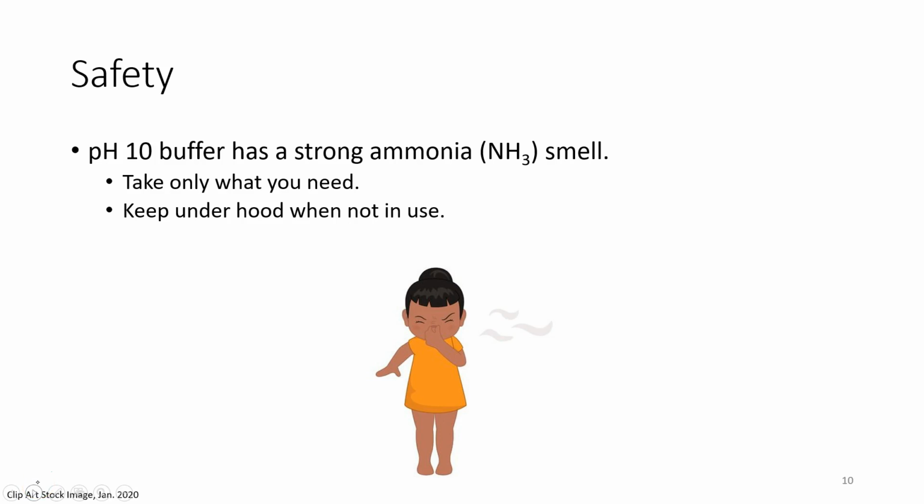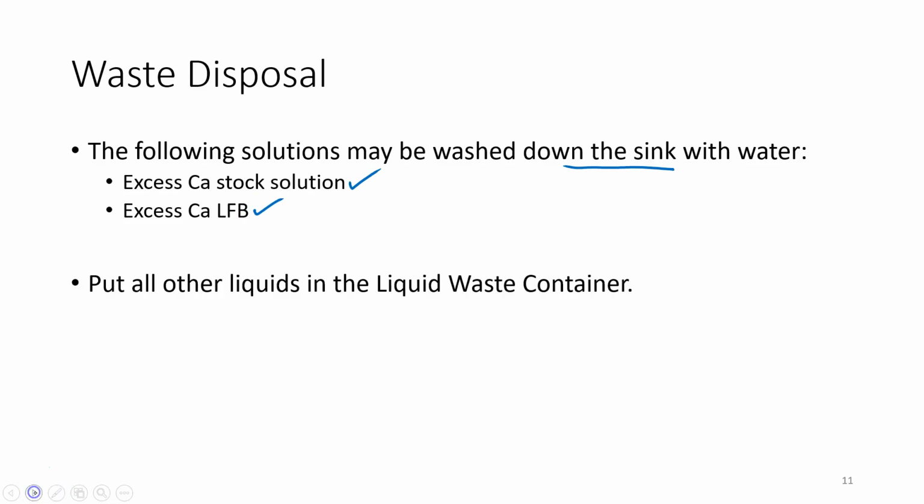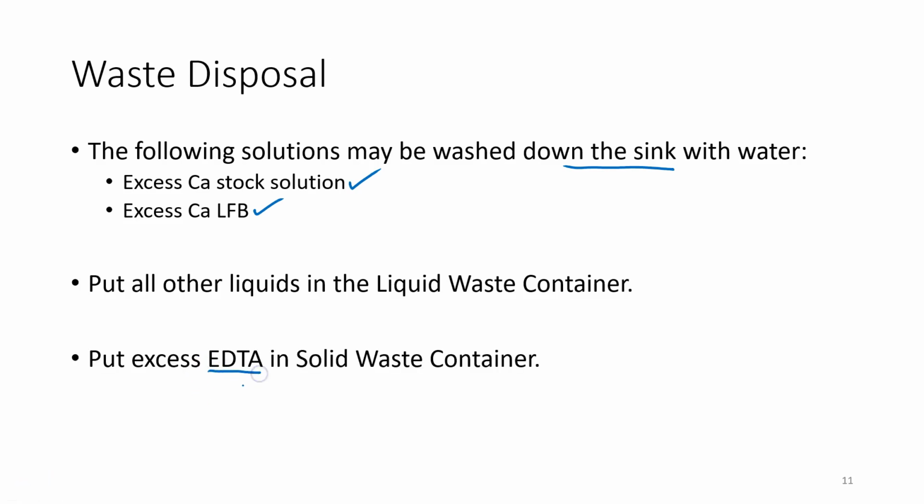The main safety warning in this experiment is the pH 10 buffer, which has a strong ammonia smell. So take only what you need and try to keep it under your hood as much as possible. There are some solutions that you actually can wash down the drain. That's your excess calcium stock or any excess LFB. All other liquids should go into the liquid waste container, and the only excess solid that you should have is the EDTA, and we'll have a solid waste container for that.